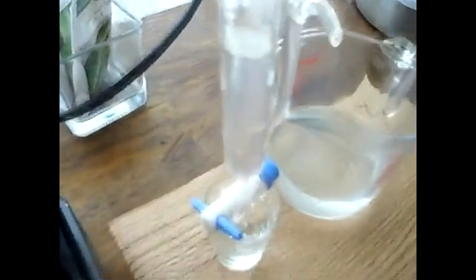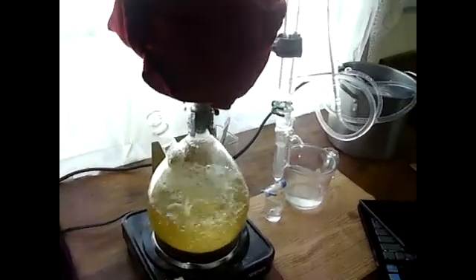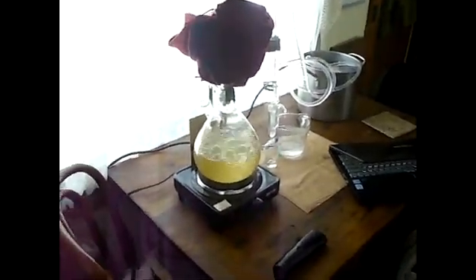There is a layer of essential oil forming on the top — it's a very thin layer there. I'm trying to get a better close-up of that. When it's all done I will collect it there. So, essential oil of thuja, for native red cedar, coming up.